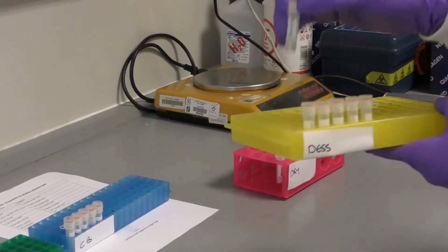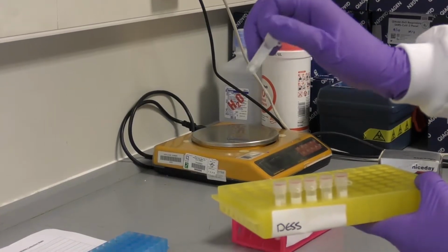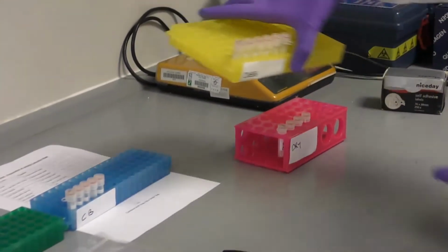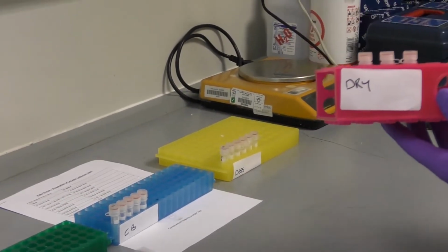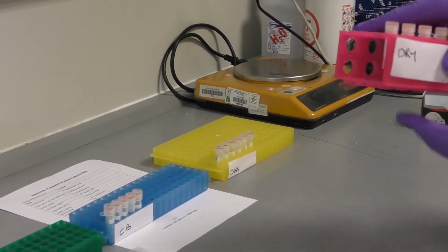Finally, do the same for your DESS media, i.e. labelled on the top, side, is within expiration date, and is clear and does not appear to be contaminated. You will also need some dry 2 ml screw cap vials in order to complete your collection bags.